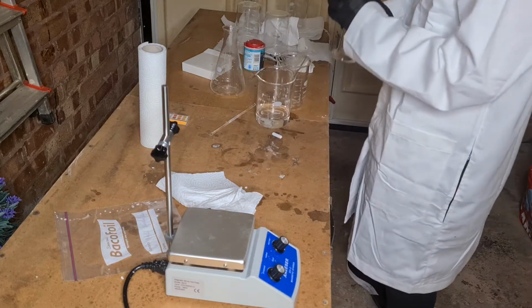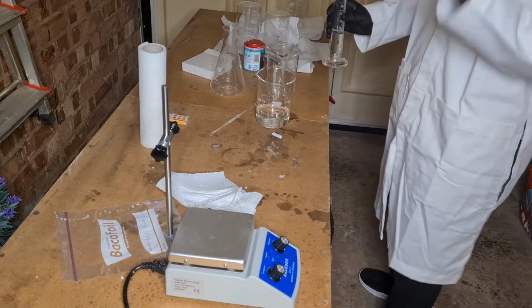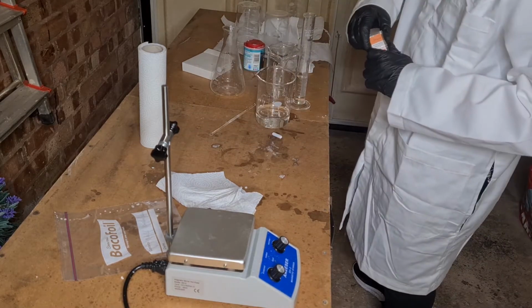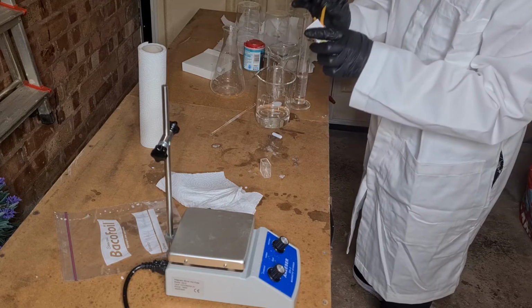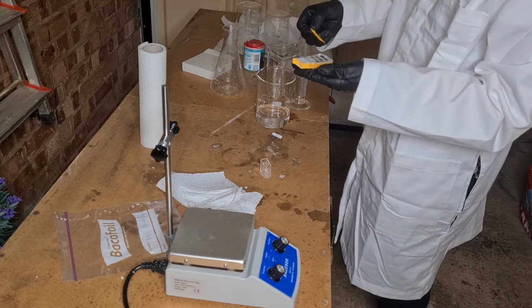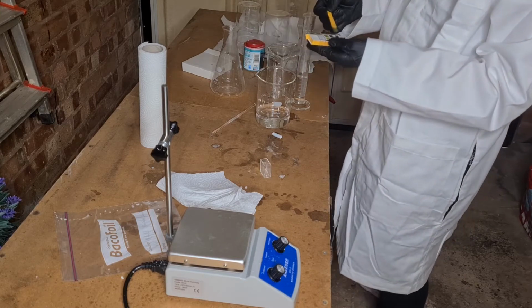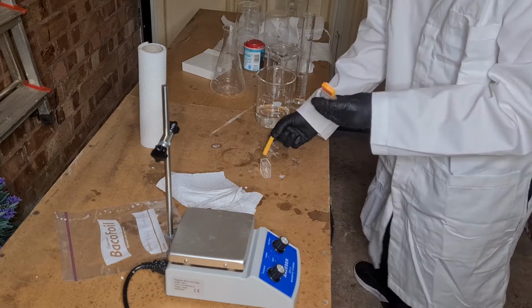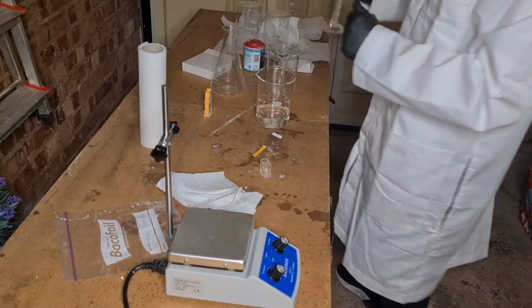So we've got hydrochloric acid. Now, if this was just water, there would be a bit of heat when I dilute it, but nothing would really happen. Watch this. Also, I need my pH paper first. So we'll test the pH of this solution, just as a little comparison, because the folks on YouTube love comparisons. And this solution has a pH of around 9 or 10, maybe even 8, because sodium bicarbonate isn't that alkaline. It doesn't form solutions that are too alkaline, which means you don't need really strong acid to neutralise it, but we do need this hydrochloric acid because we're making sodium chloride.